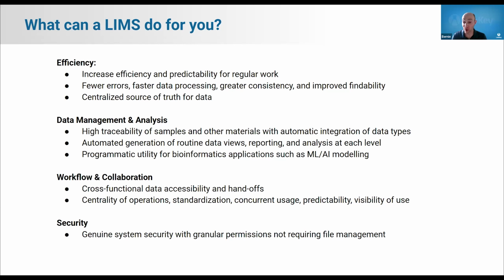A good LIMS is going to provide programmatic utility for your bioinformaticians, data scientists, or whatever other name these wizards go by at your institution. And they want structured data for their additional analyses or to feed their various models, machine learning, AI, stuff like that. On the workflow and collaboration side, LIMS can really help smooth interactions between scientists, as well as between teams and organizations. With users across different teams, the natural siloing of data is lessened.